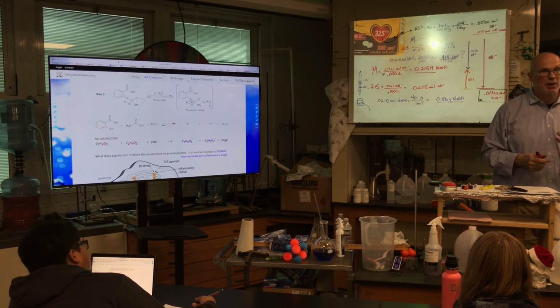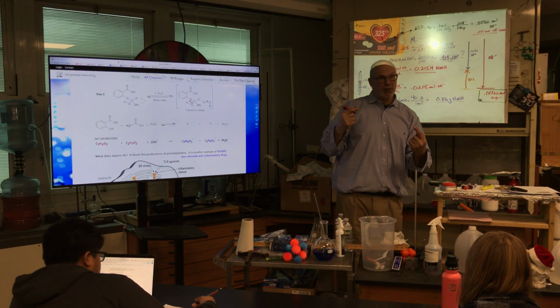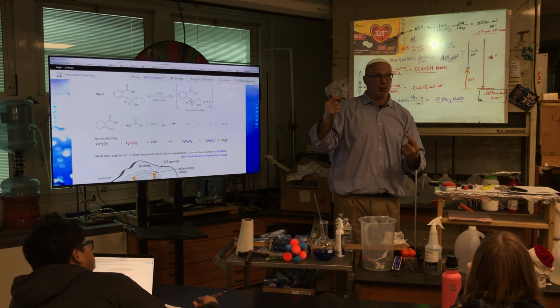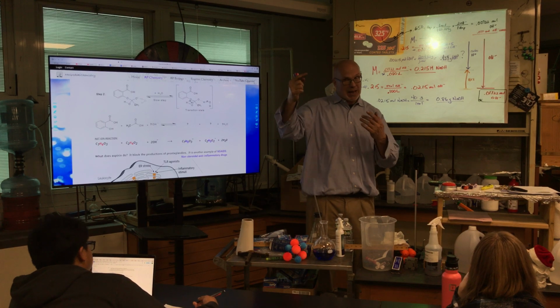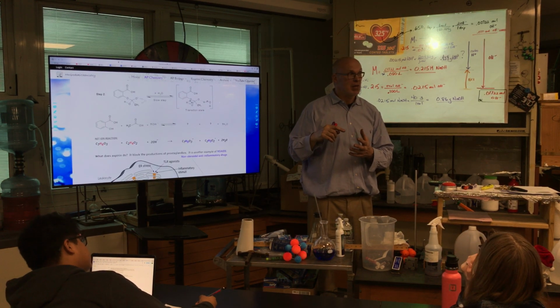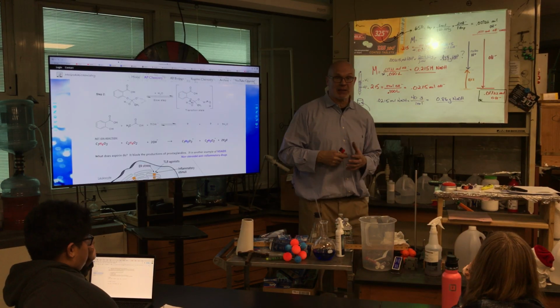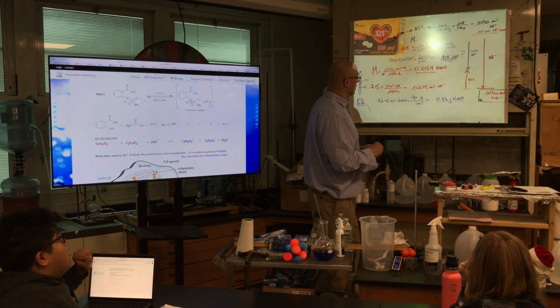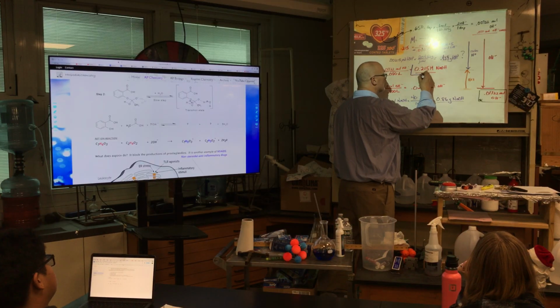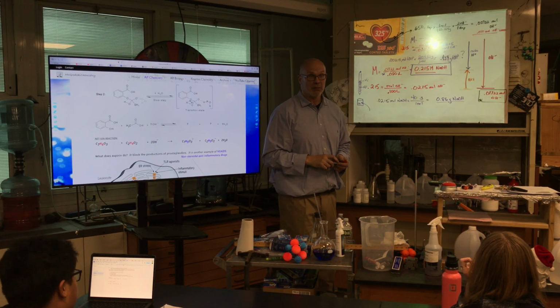Why? Because sodium hydroxide is deliquescent. It's going to absorb water out of the air, and it's going to react with CO2 out of the air, which is a Lewis acid, and it becomes sodium carbonate. Because it's so reactive, it's constantly reacting, so this right here, my friends, is not the molarity.